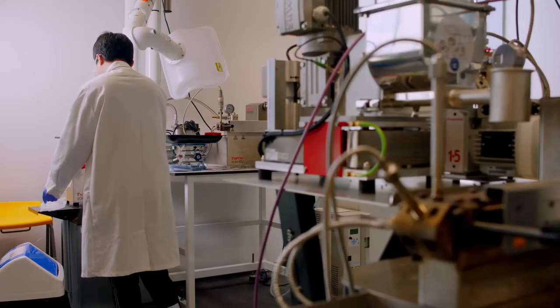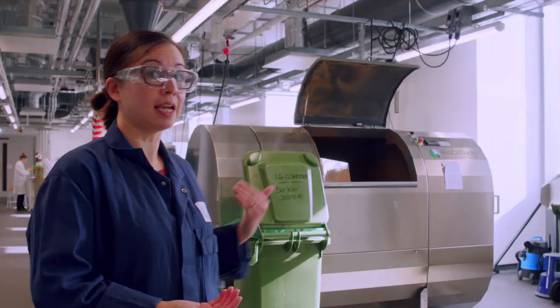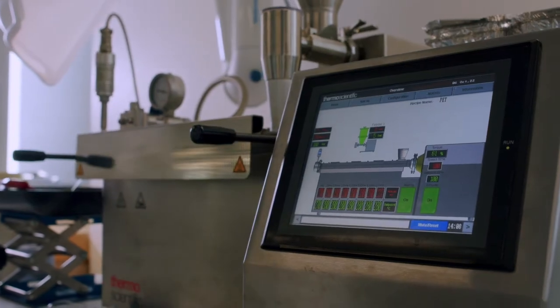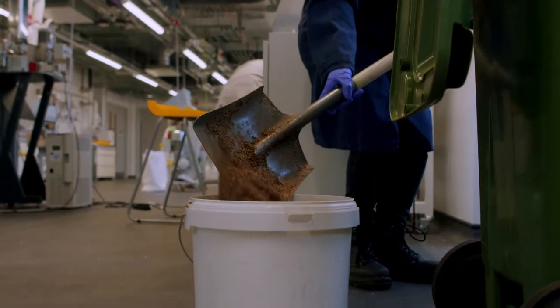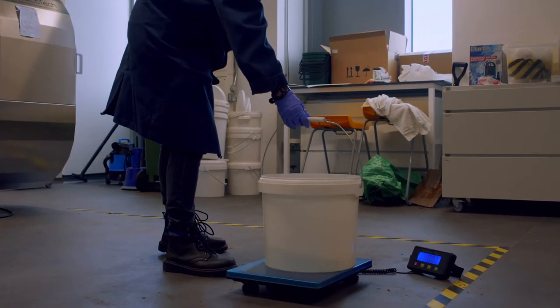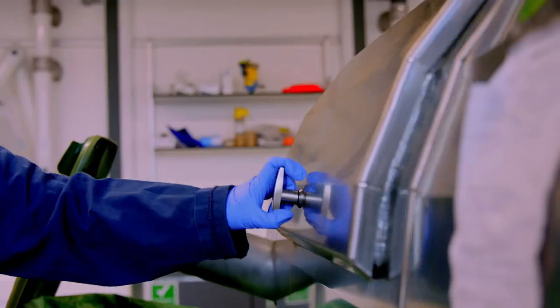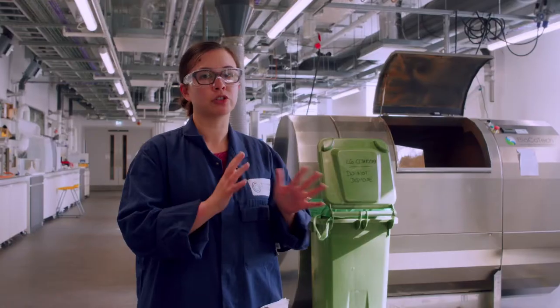So this is our end of life lab and we call it that because the kit in here is basically used to process polymers at the end of their product life. So we have a few bits of equipment in here. We've got our industrial composter that enables us to test compostable plastics. We can also try and work out how long a new compostable plastic would take to compost under these conditions.